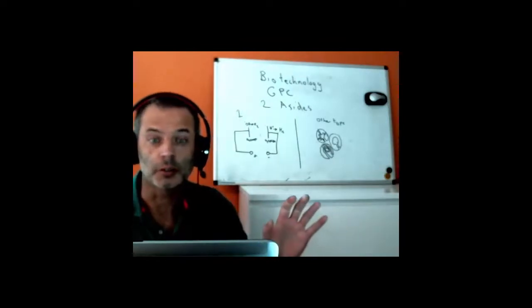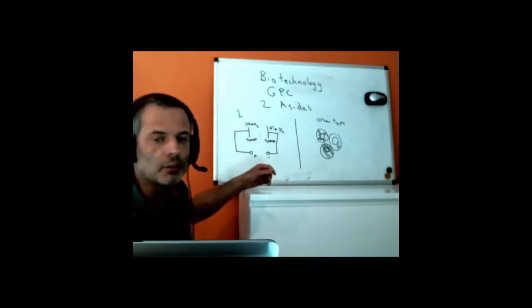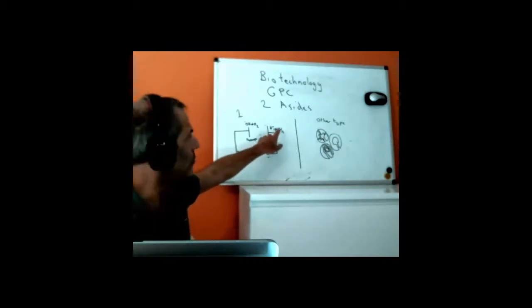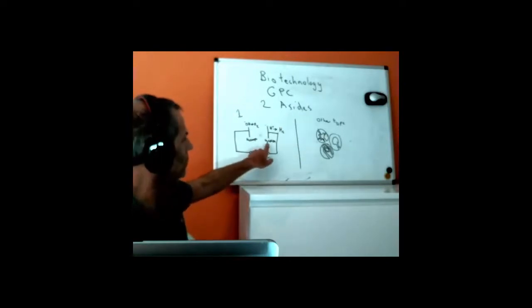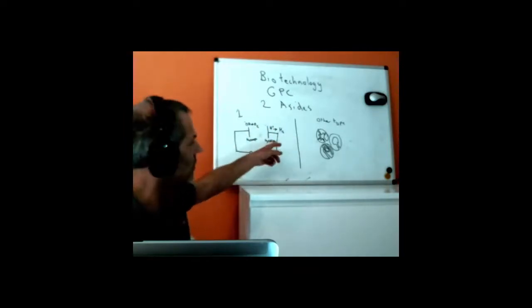A couple of asides because I missed some things. First of all, if we apply a voltage to water and it's high enough, we run some current through it, what we would expect to see is that the negative electrode will make hydrogen from H+, so we're taking H+ away. We'll also make hydroxide ions from water. Effectively we're making new H+ when it runs out.